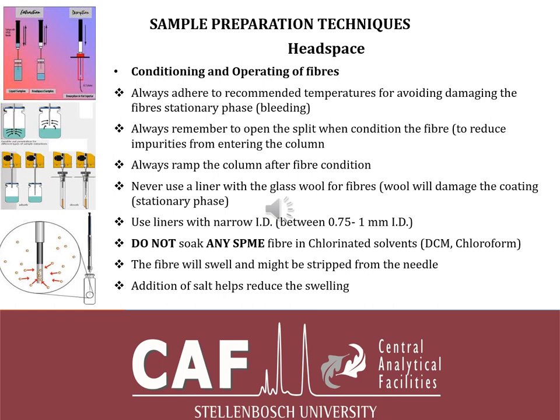So one of the questions one might ask: what if I have to analyze for chlorinated compounds in my sample of interest? You definitely have to make sure that your sample is in more of a watery medium. Maybe one can first dissolve the sample in methanol, or maybe in acetone, to break down the chlorinated solvent, and then obviously add a little more water, because the most important thing is not to have more of the chlorinated compounds in there.